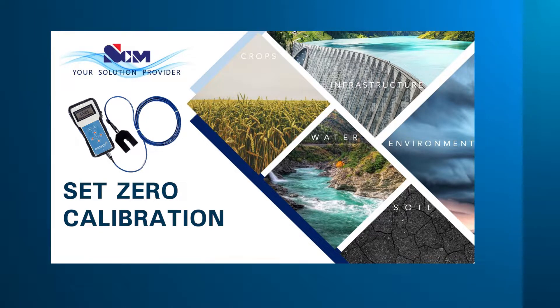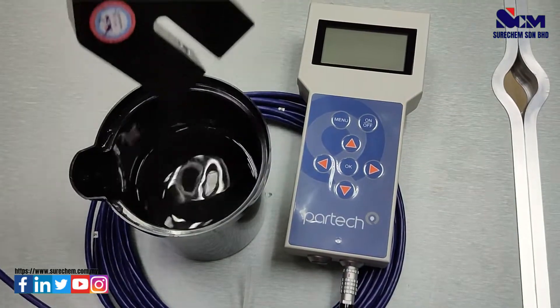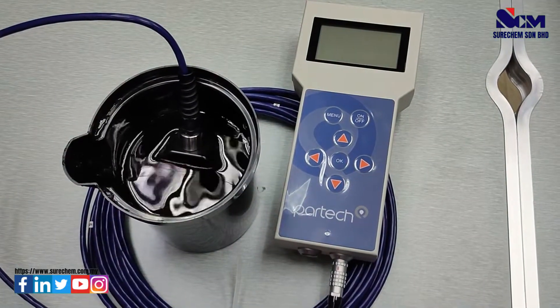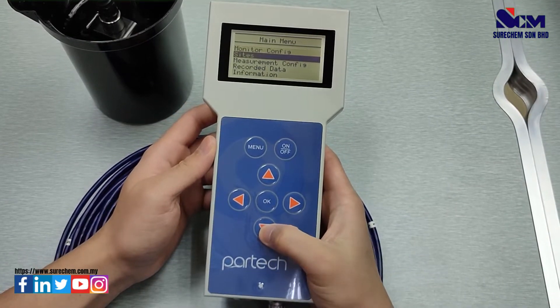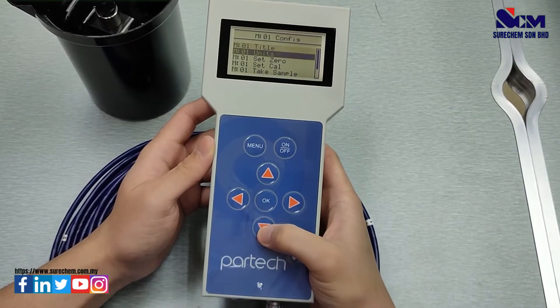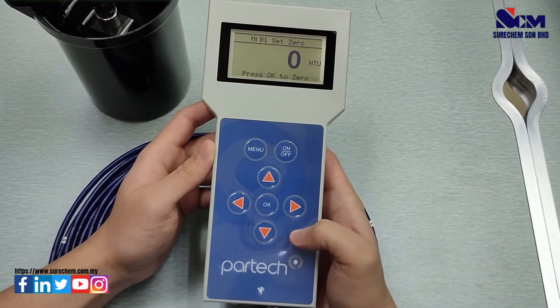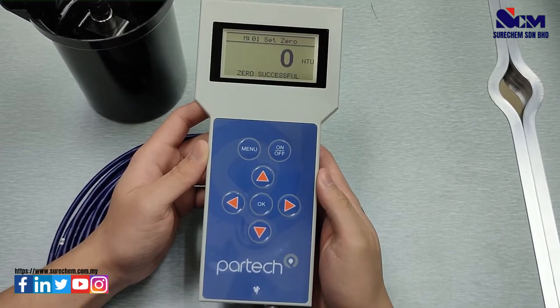Back in the menu you will see the units and title are correct. This step will show you how to set zero calibration. Take the sensor and submerge it into distilled water. Press Menu, go to Measuring Configuration, select Turbidity, select Set Zero, press OK, and press OK again to calibrate zero. Wait — it will show zero successful.